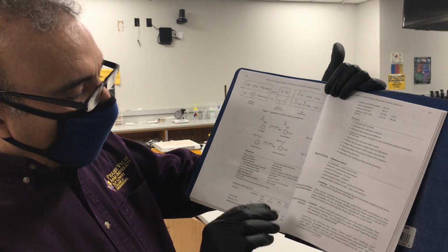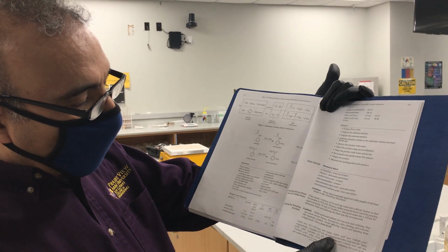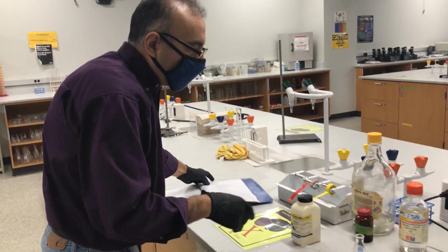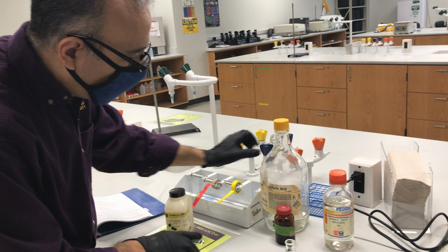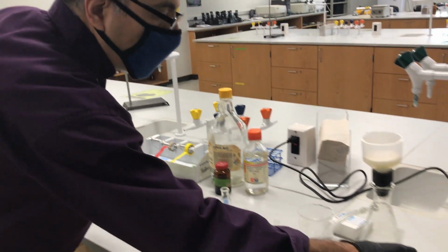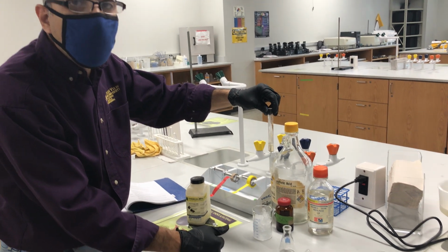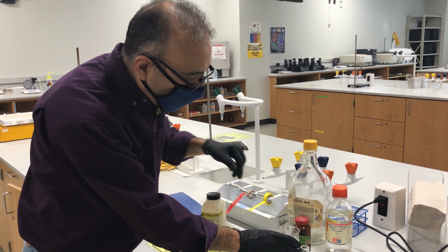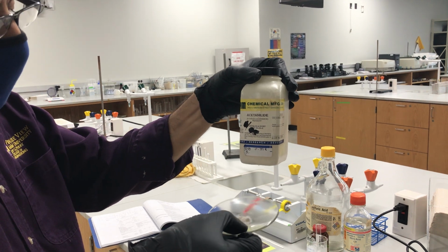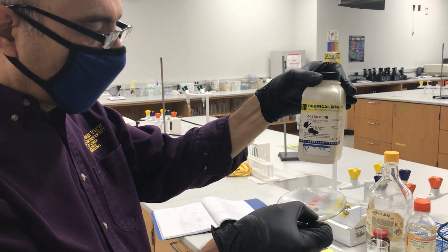The first part here is to make the solution of nitronium ion, and this is done using nitric acid and sulfuric acid. As you can see here, we have the sulfuric acid and we have the nitric acid. I mixed this solution over here, and I now have the solution which we need. So the solution of the nitronium ion we have over here, and I also already have half a gram of acetanilide, which is what we are going to use.